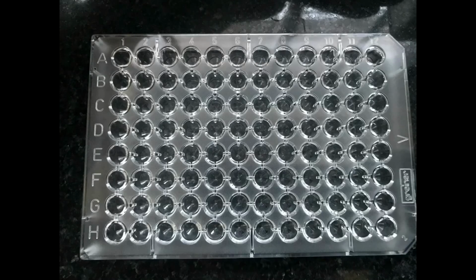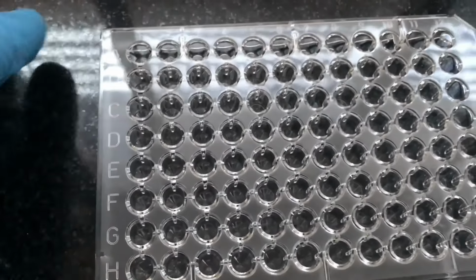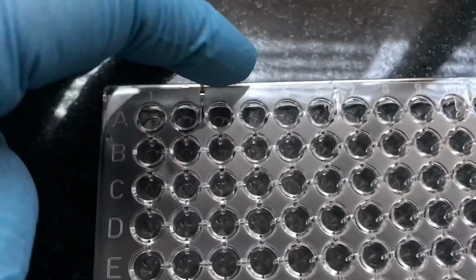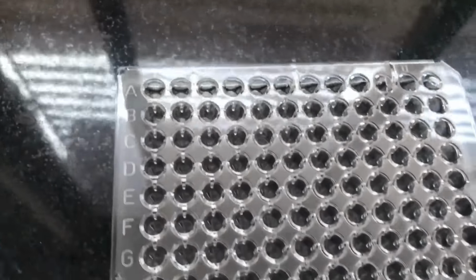In ELISA, we play with sample and reagent in this plate. This plate has 96 wells, so it is called a 96 well plate. This plate is in the ELISA kit provided by the kit producing company. There are 8 rows, as A, B, C up to H, and there are 12 columns, as 1, 2, 3 up to 12. So there are 96 wells in this plate.